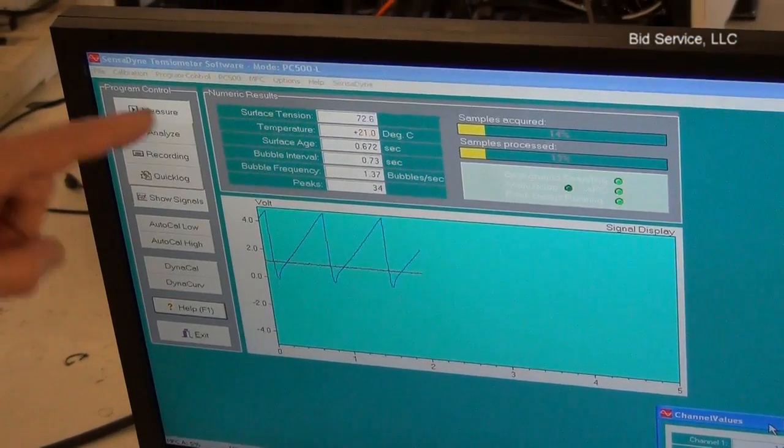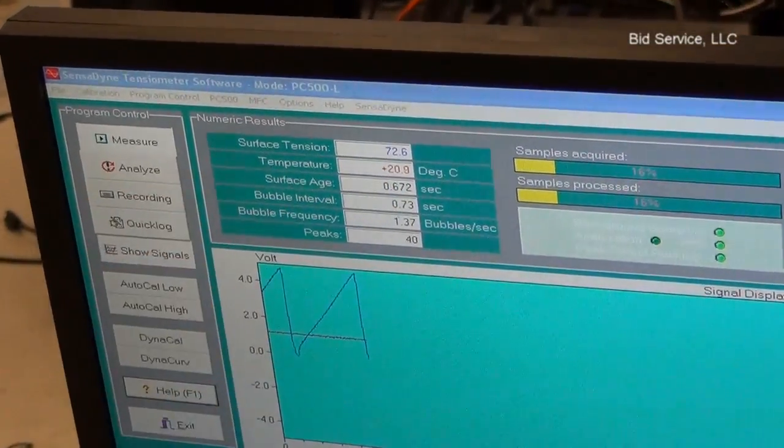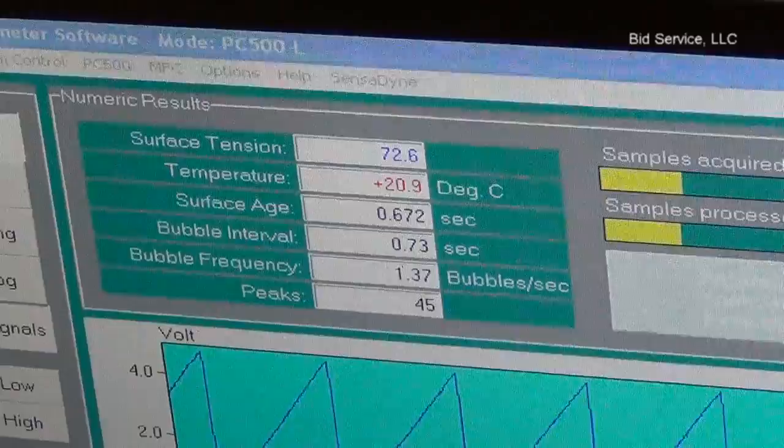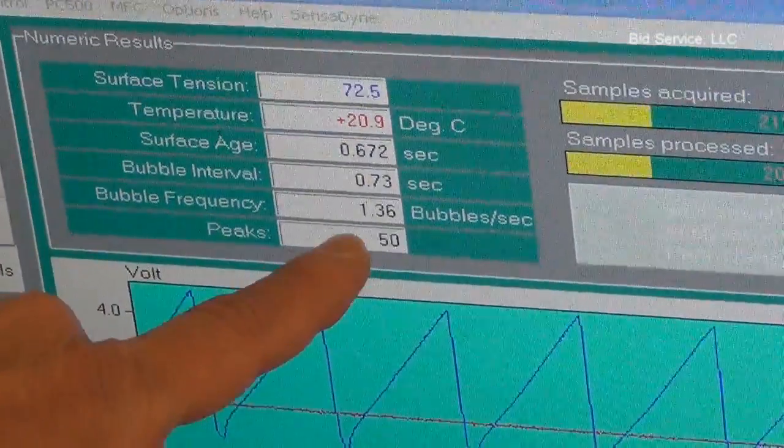What it's reading here is the surface tension of 72.7 for water, which is the standard. And here you can also see the bubble frequency set at 1.36.